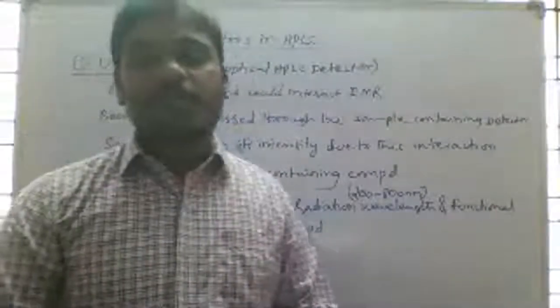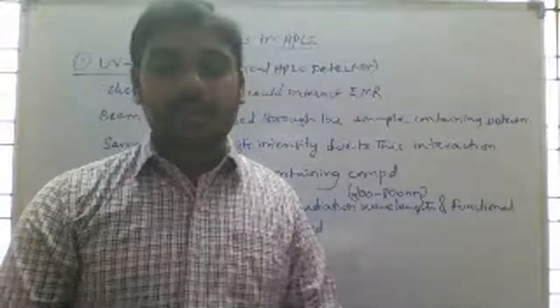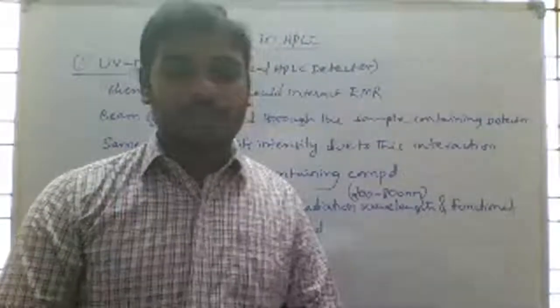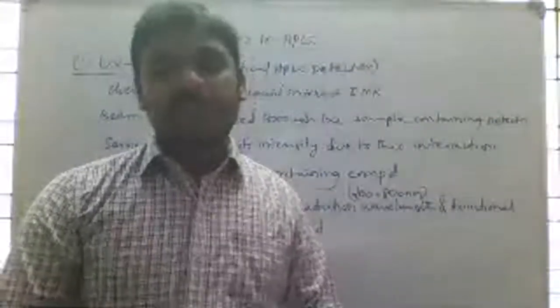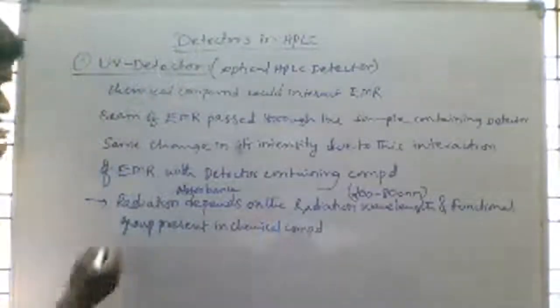The majority of organic compounds absorb in the 200 to 800 nanometer or 200 to 600 nanometer range.